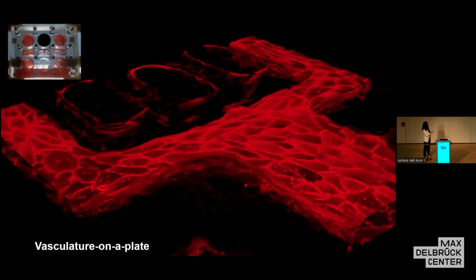So this is just a picture that shows the endothelial cell staining. After about 48 hours in angiochip, you can see that it is possible to line these cells and have them proliferate everywhere. We were talking about this earlier. It's actually quite hard to line channels perfectly with endothelial cells, and really the coating is the key. So Boyang used gelatin. You have to figure out which coating to use.